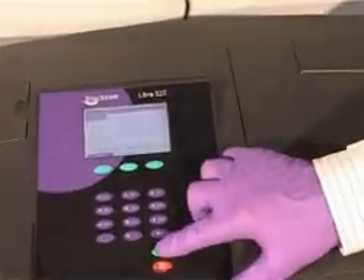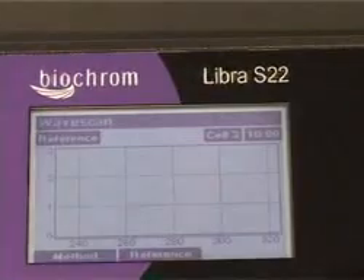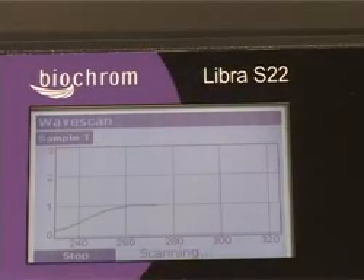The reference cuvette is placed in position 1 and the sample cuvettes in other positions. The reference is measured, followed by the sample, and the result is displayed on the graphical display.